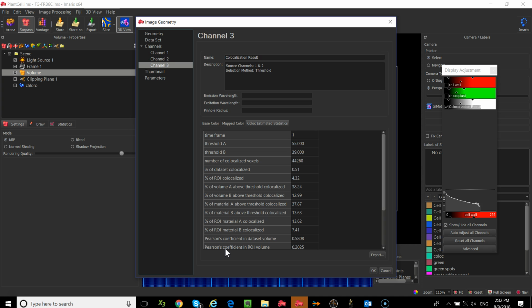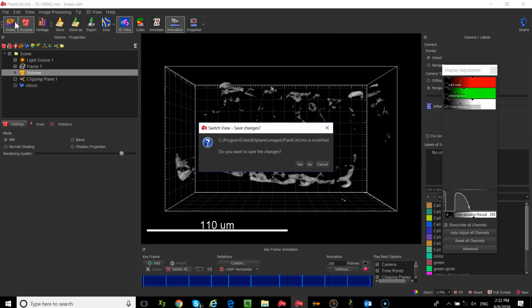So you can do it in a couple of ways. You can use the masking feature here. One other thing you can do is actually use a surface to basically put a boundary on the structure of interest, like your nuclei, and mask the outside to black, make it 0. And then it's effectively the same thing. So you can do it in multiple different ways. That way it's just kind of doing it all in one dialog for you. But yeah. Okay, next, I'm going to switch to a different data set.